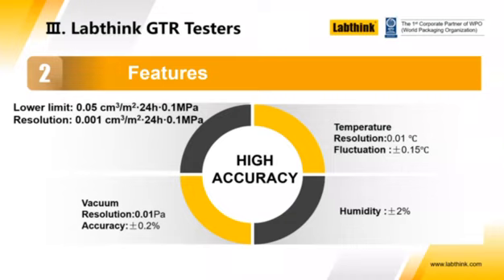Temperature, its resolution is kind of similar to what you would expect, a resolution of 0.01 degrees Celsius with a plus or minus 0.15. And then we also have specifications for humidity control.